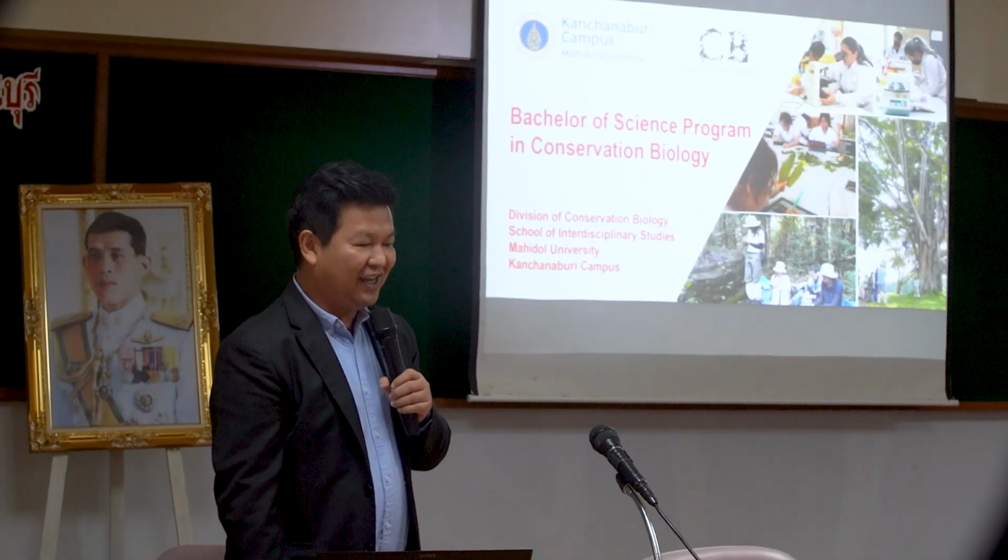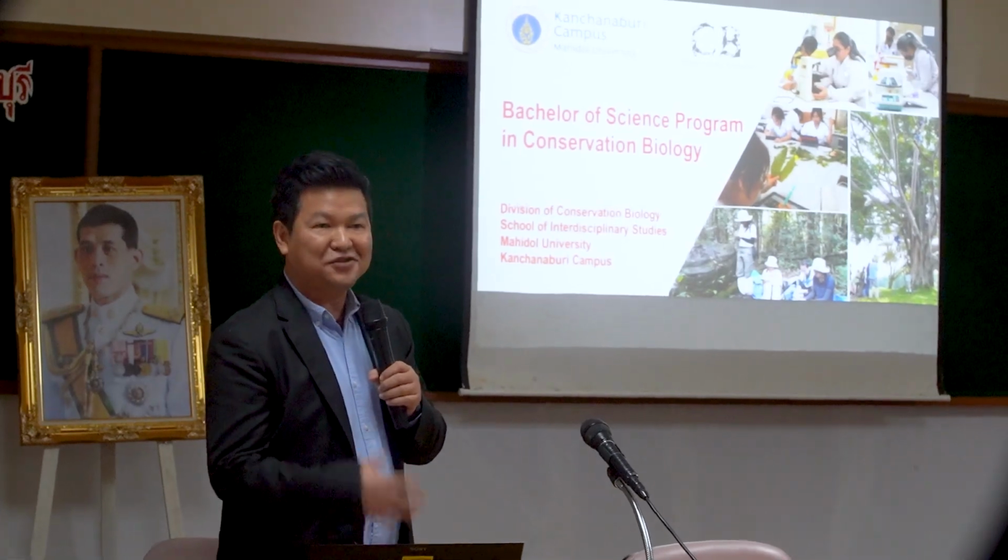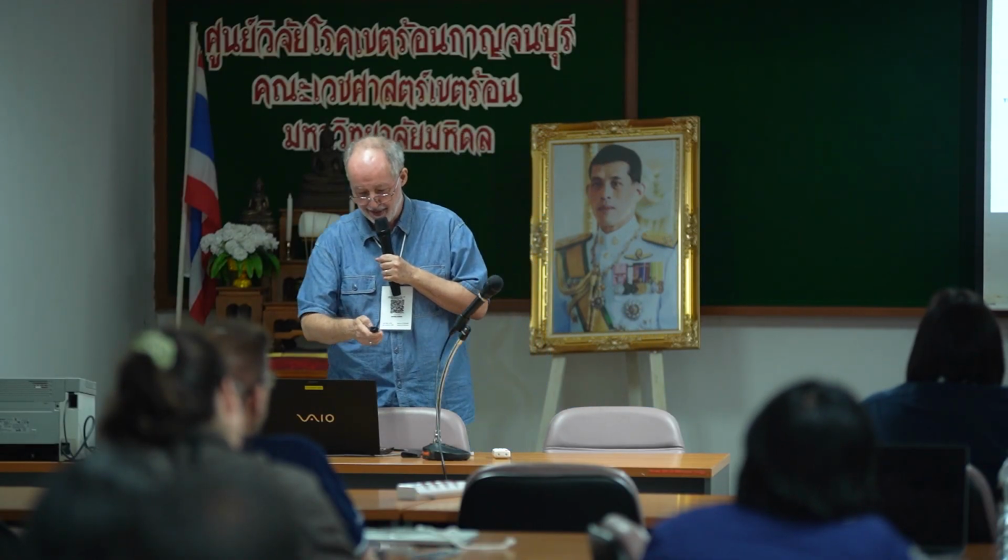This is the first workshop of the genomic sequencing workshop series that we aim to enhance capacity building of researchers at international and national levels in terms of genomic sequencing for tropical diseases. And in this first workshop, we are focusing on field data collection and also applying genomic sequencing in a field-based approach.